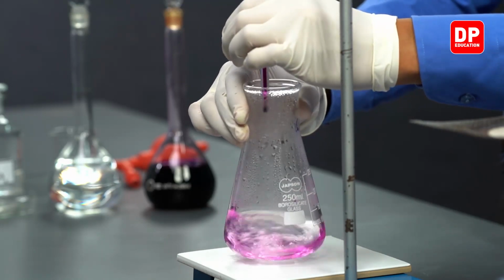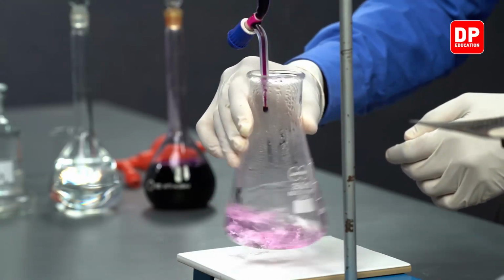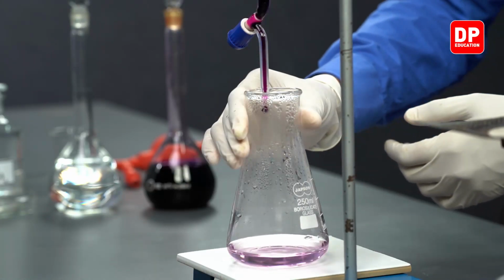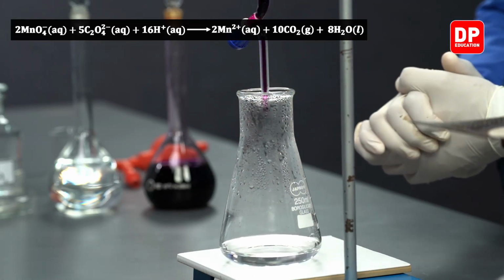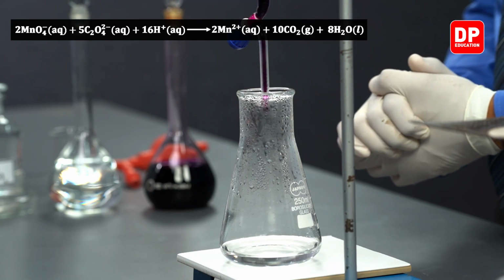We are expecting the color of this potassium permanganate solution to remain stable for a while, but as you can see, once you add a little bit of potassium permanganate and allow it to react with the solution a little bit, with time it completely disappears.